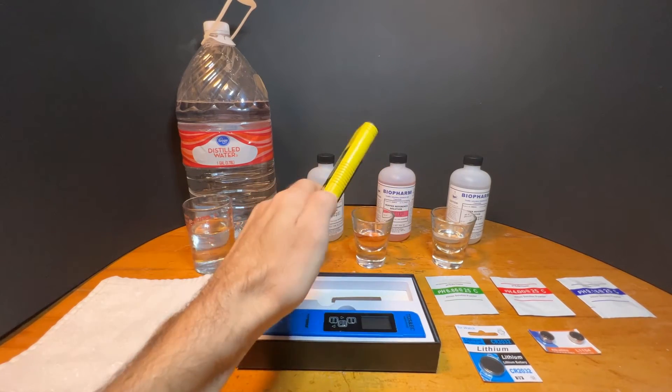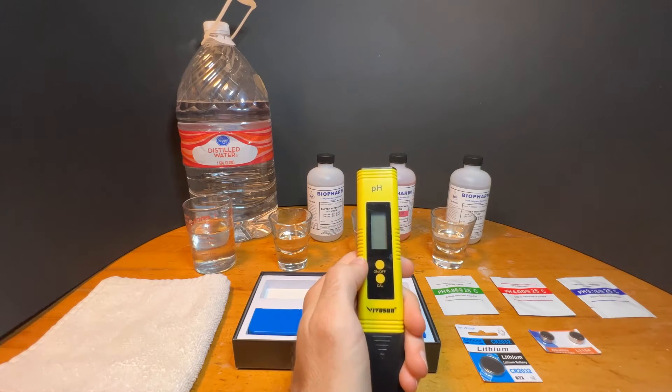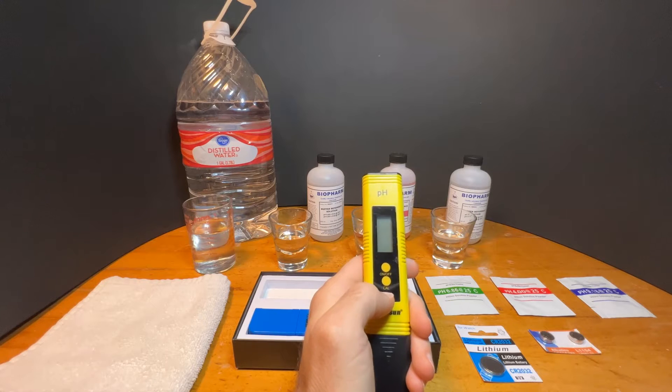The PH meter should be calibrated before your first use and any time you accidentally hit the calibration button, then about once every month during regular use.